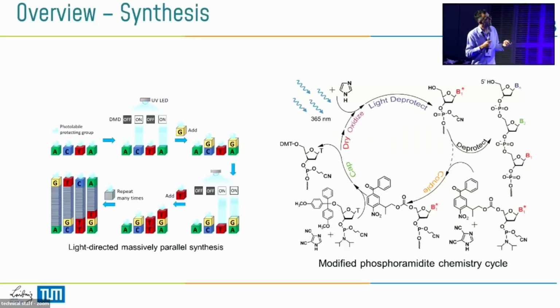So at this position where G is set here, imagine instead of G, it's a mixture of G and C, like 50%, 50%. And when we read the data from the sequencing, in that position, we can see C and G, 50% and 50%.